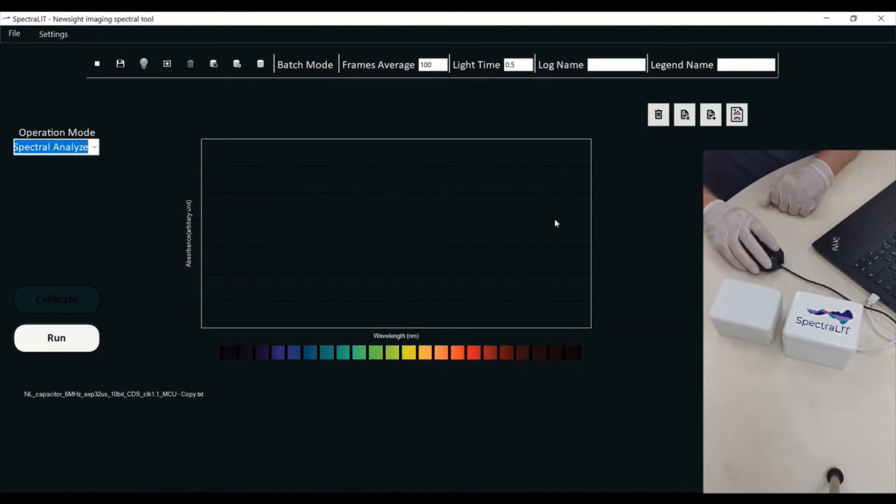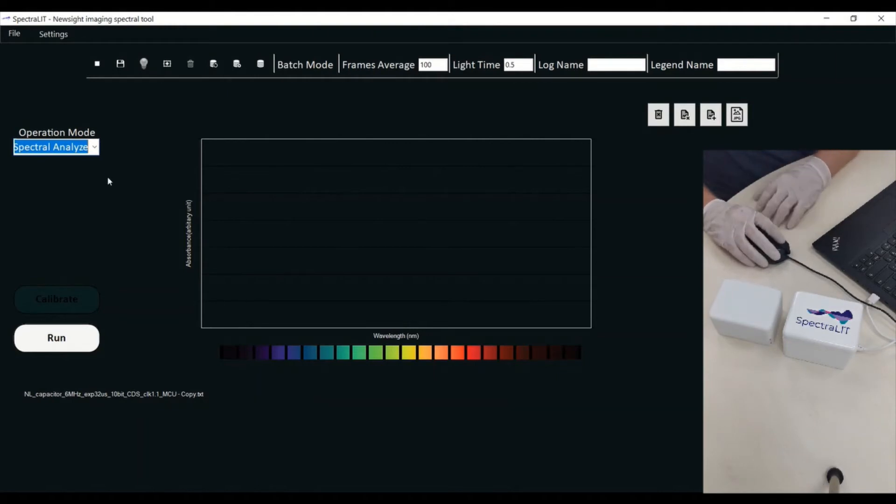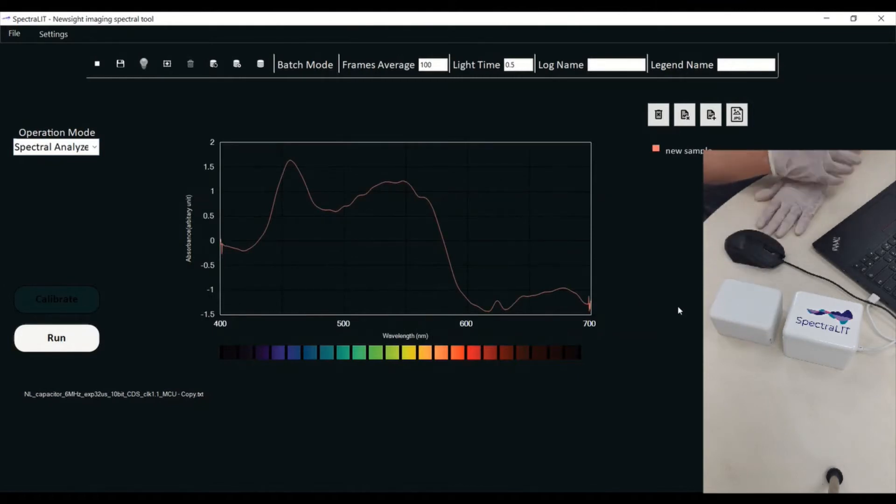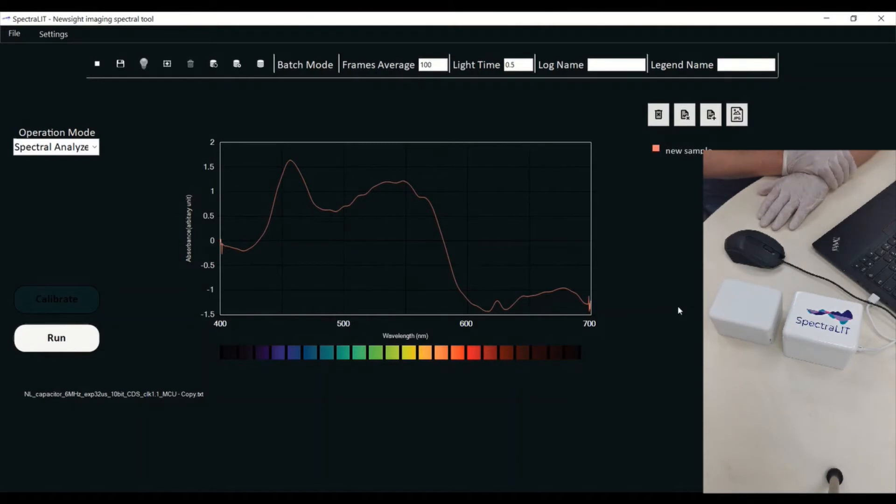I just put a substance inside. I can do a Spectral Analyze by pressing Run. Spectral Analyze will give me the spectral profile of the substance that I put inside the device.